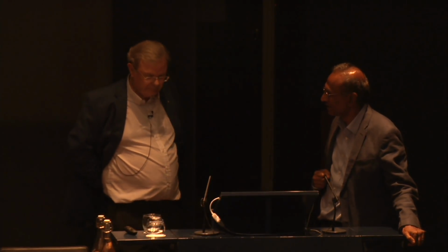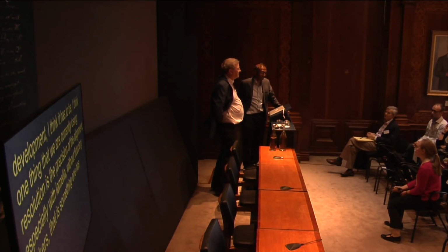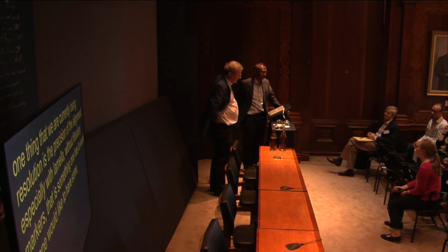So perhaps I could ask one last question. Where do you see the technique going in the next few years? There are obviously advances in detectors, the new generation of detectors, and other technologies. I think it will not be a single development. One thing where we are currently losing resolution is the precision of the alignment of the tilt series, especially with lamella, without fiducial markers. So I think that is something one has to work on. Maybe ribosomes are good as fiducial markers. That is certainly one consideration.